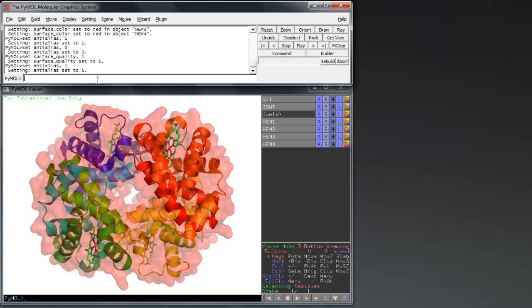We are now going to render an image of our protein using ray tracing. This is a powerful tool which allows users to make journal quality images. Set the camera as you wish and enter the command ray width comma height.